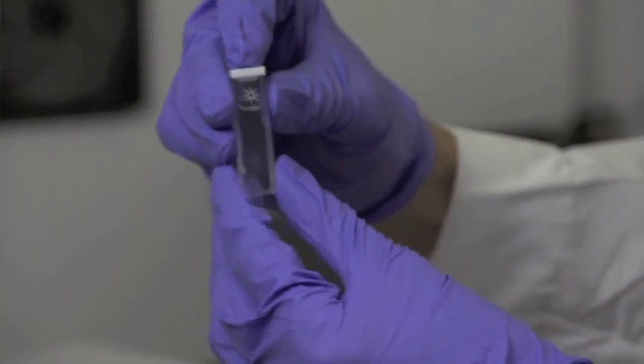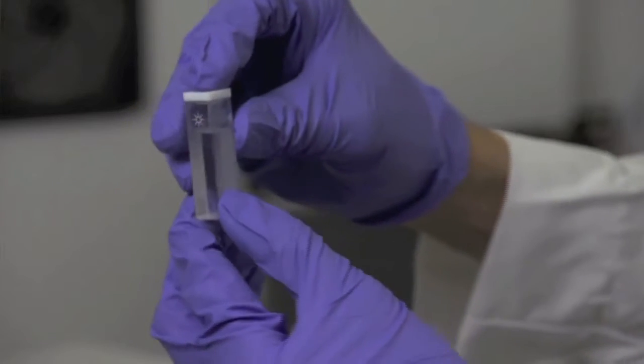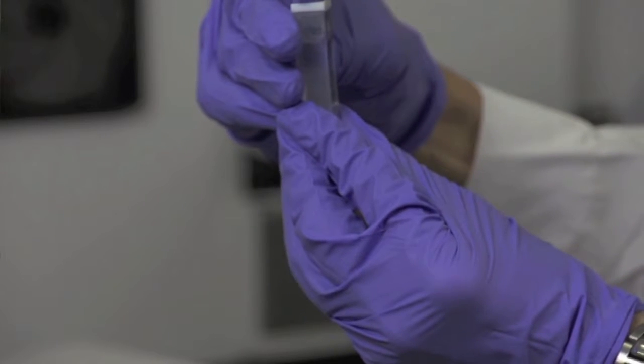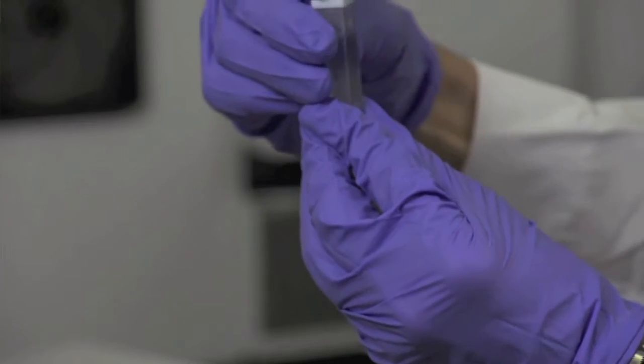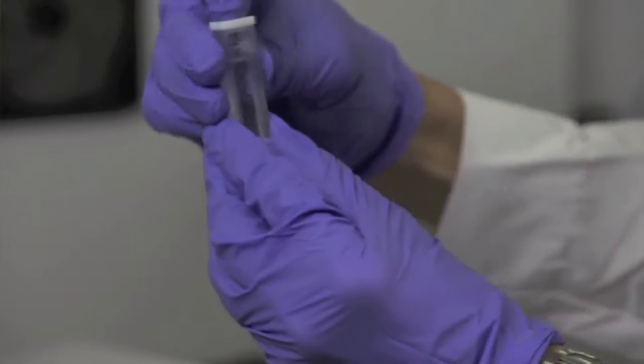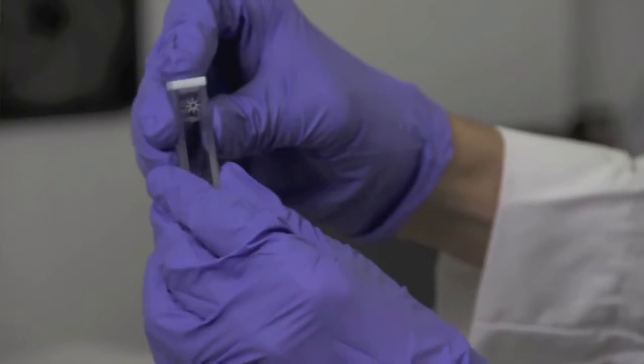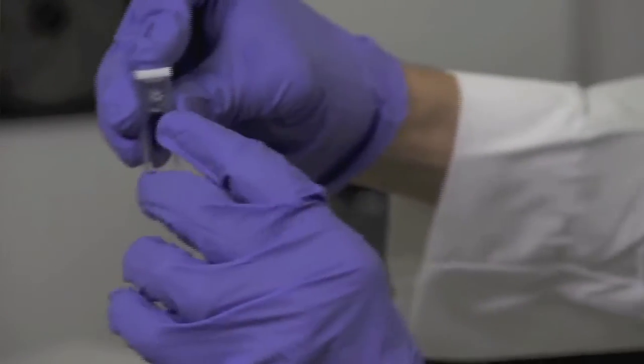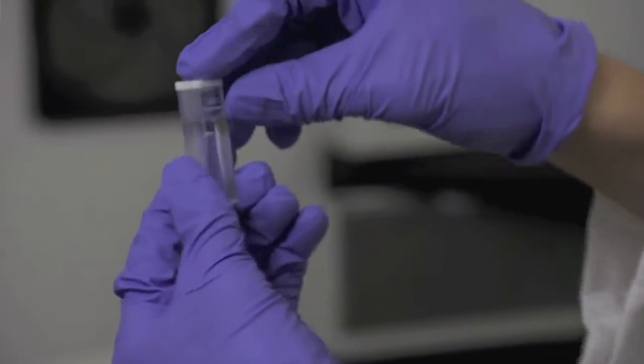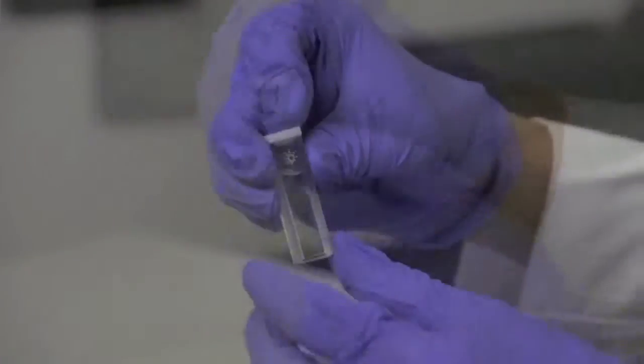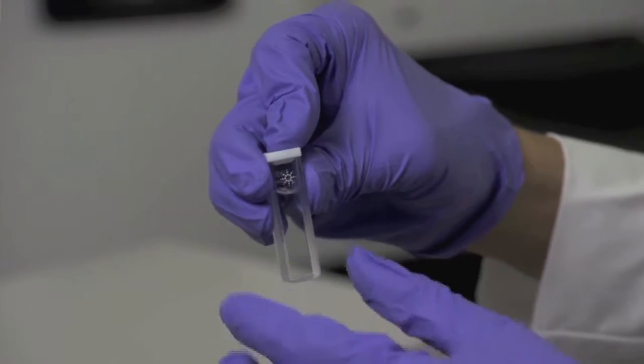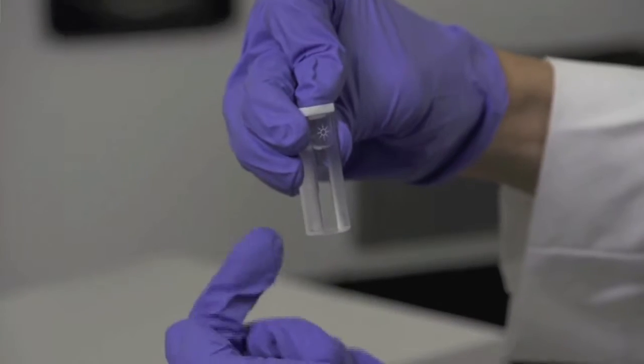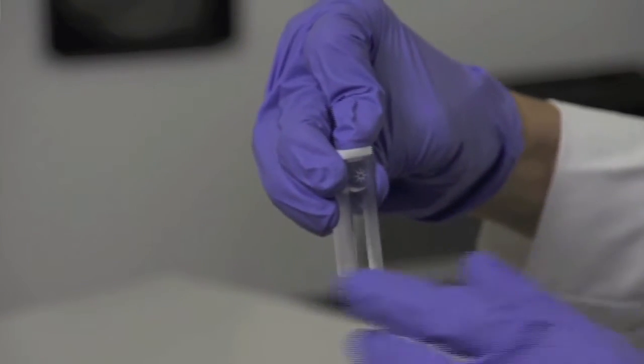Notice with the quartz cuvette that two of the sides are frosted, and these you will not want to place in the path of the beam, otherwise your spectral quality will not be good. Also notice that it will be unnecessary to mark the top of this cuvette because there are two different indicators on each side. The side of the cuvette with the little sun image will face towards the front of the bench, such that the beam can go through that portion of the cuvette first.